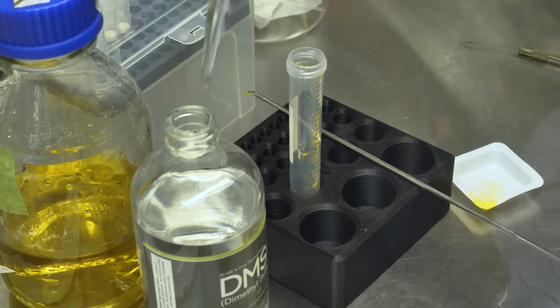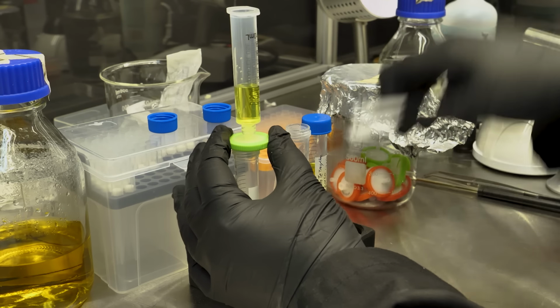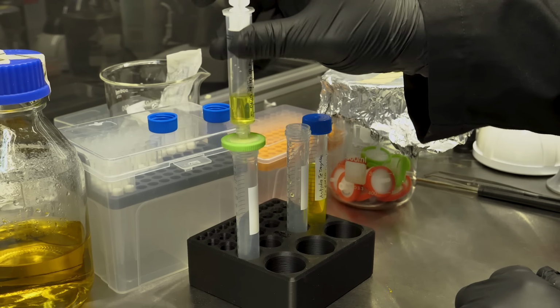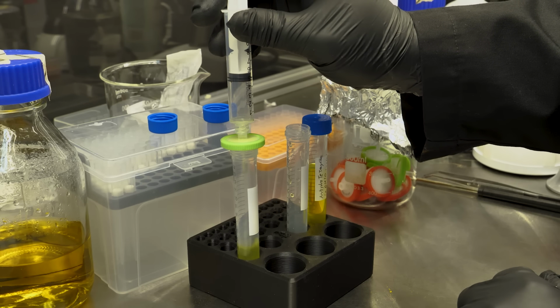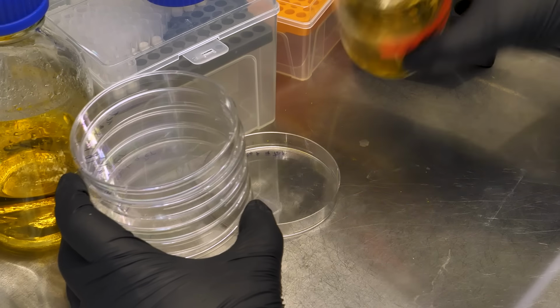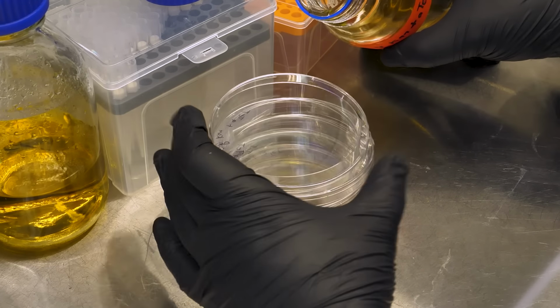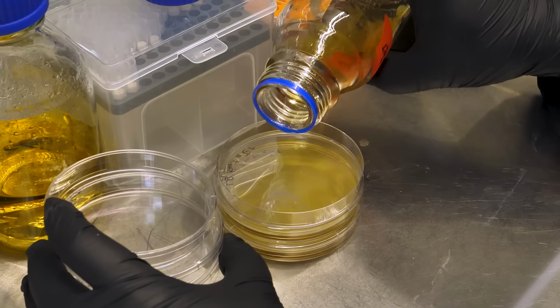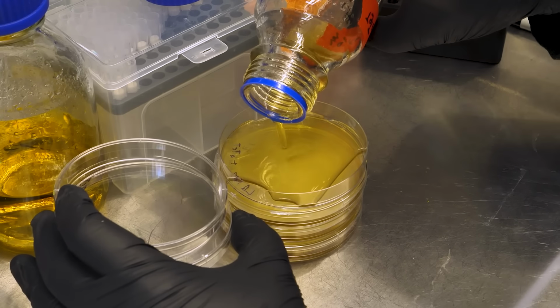Antibiotics usually come as a powder, so we have to make a concentrated stock solution, which is then sterilized with special syringe filters. These have pores that are so tiny that no living organism can fit through, effectively sterilizing any solution passing through one. Then when the bottles are cool enough that you aren't getting burned, but they are still very warm, we can pour the media into petri dishes which come pre-sterilized. These can then be allowed to cool and solidify, but with that done, we can finally prep our bacteria.